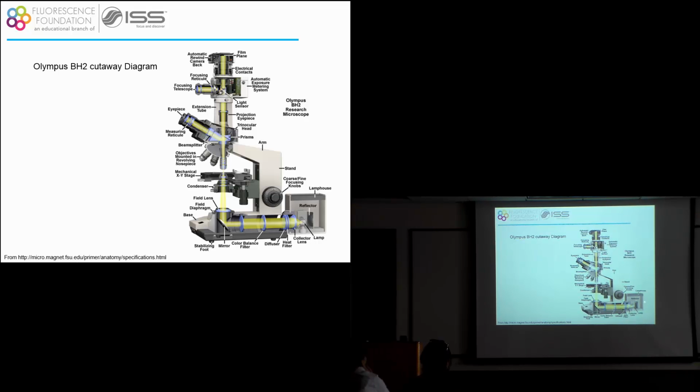So here we have the light source. The illumination source goes up here. The sample is placed on the stage, which typically moves XY. And we have several optics here to make sure that the beam is focused on the specimen. We have one objective which collects the fluorescence, and typically there is a carousel where people mount additional objectives.